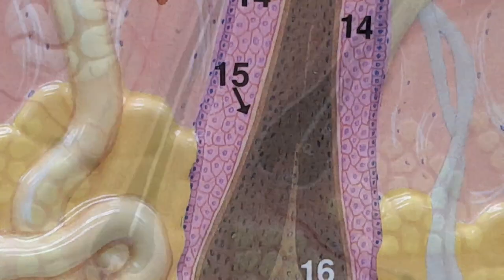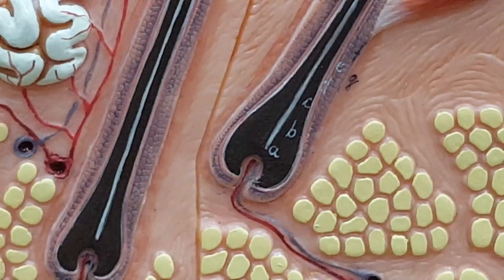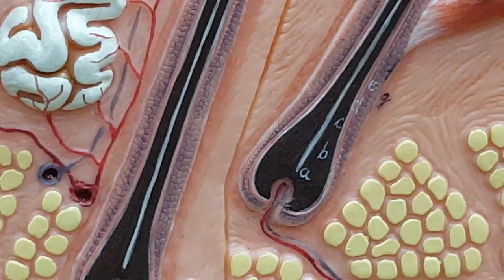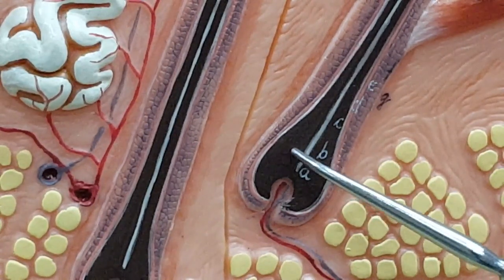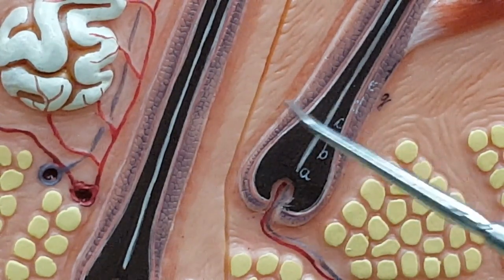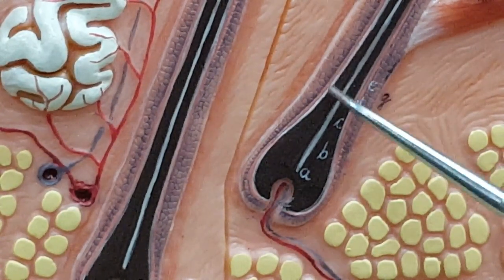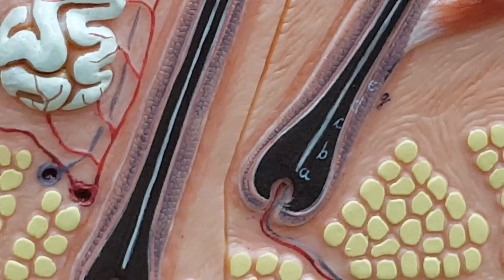Very nice on this model. If I was to look at one of these, oh, I can see a little bit here. I don't know if it's quite as nice. I can see the papilla and the bulb for sure. I can see medulla, this white line, and cortex, the dark. And then I can see, if I look closely, dermal root sheath here, external right there, and internal right here. But I don't know if it's quite as nice as that other model.